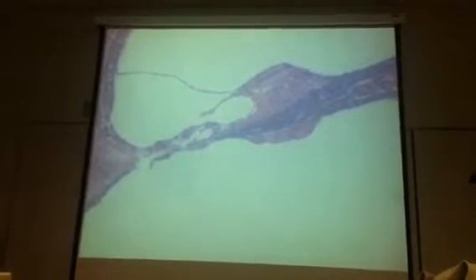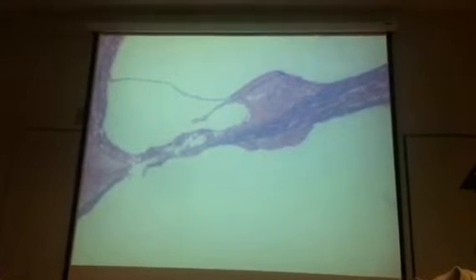So that in the middle, you have to see the organ of the corti. This is a cross-section of the cochlear. This is a different slide, though.